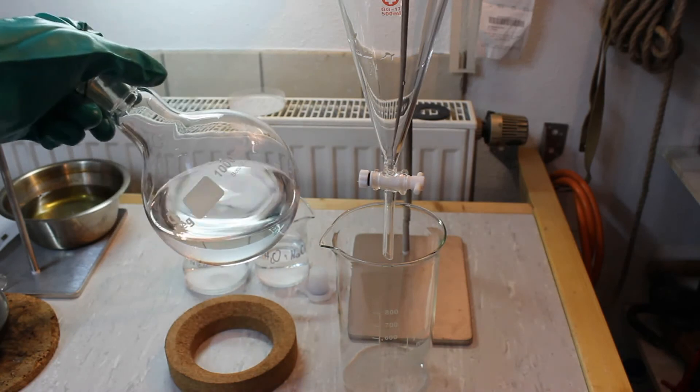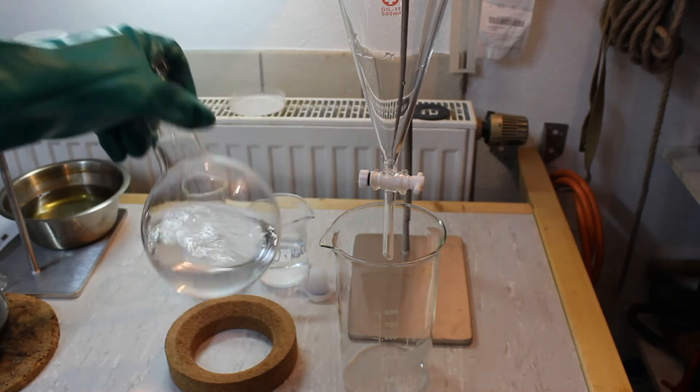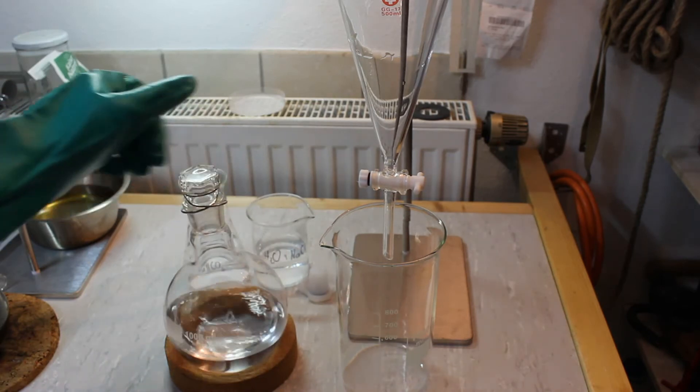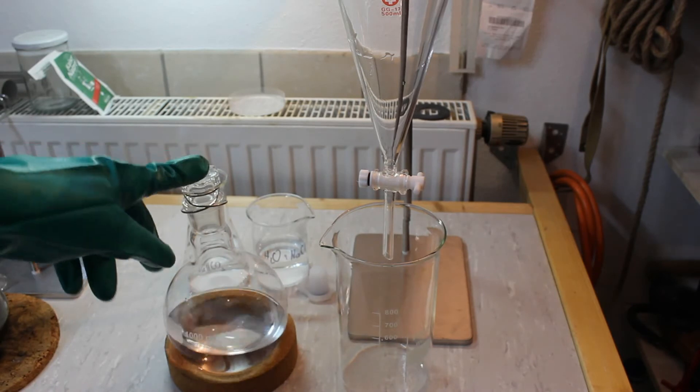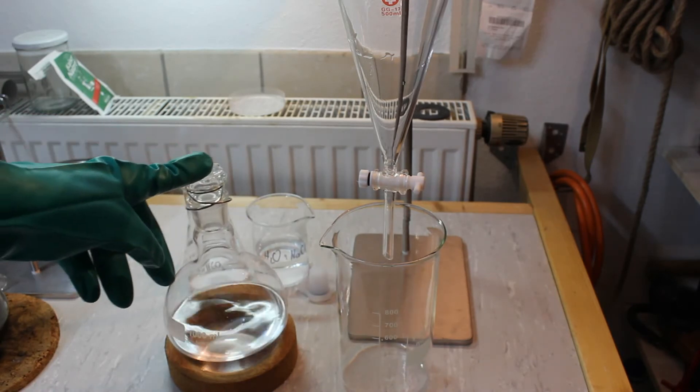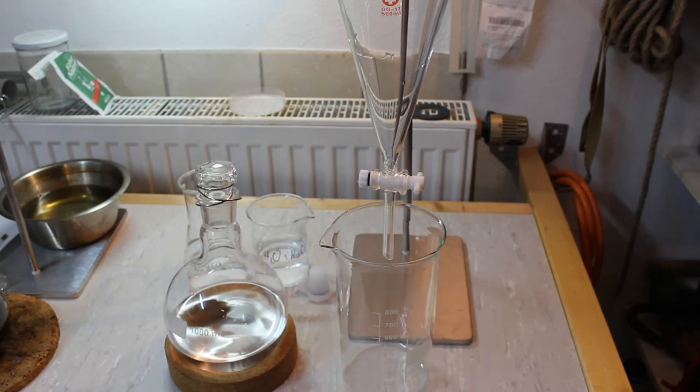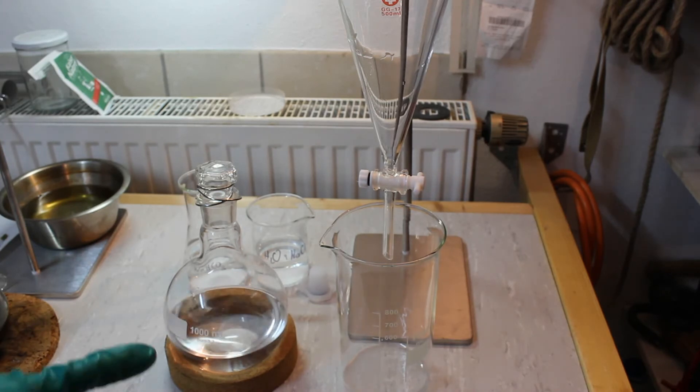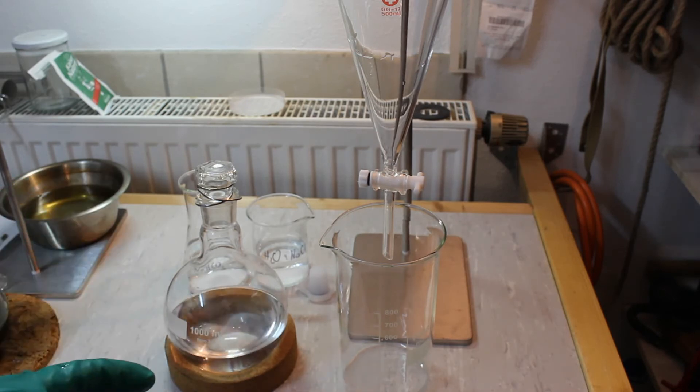After the distillation we're left with this yield of very crude diethyl ether. In order to further purify it we have to wash it first. Washing serves to remove traces of acid as well as ethanol. So we're going to wash with saturated baking soda solution twice and then once with a saturated salt solution. So here goes the first washing.